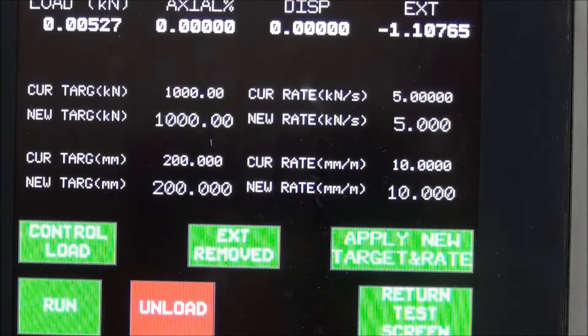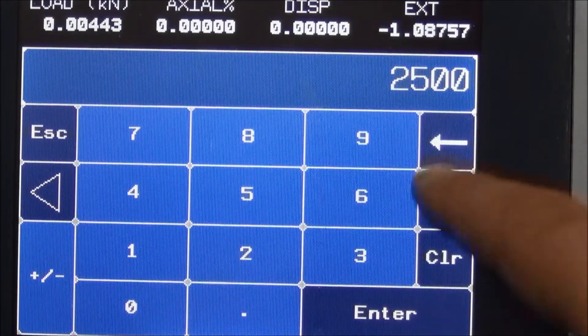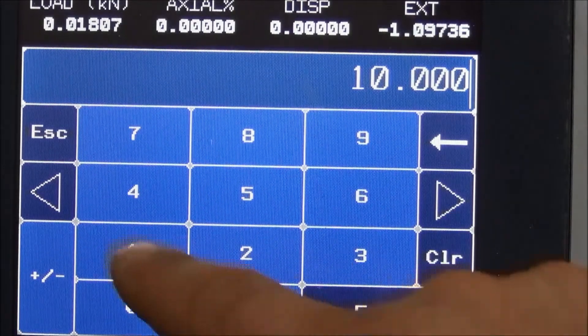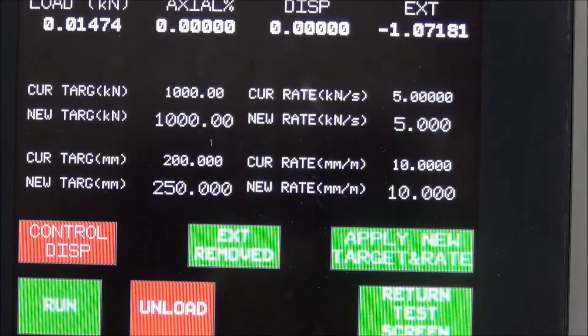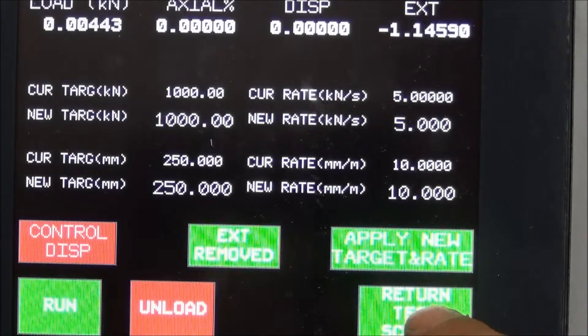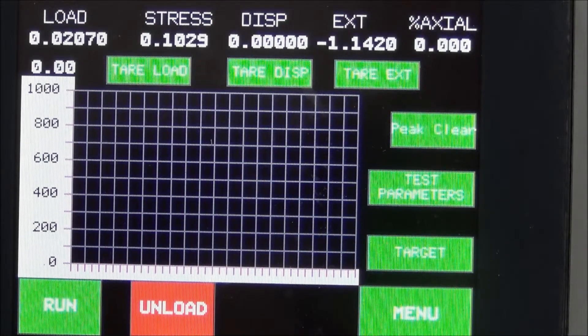If you want to perform the test in displacement control, press on the control box and change to red — displacement control mode. Change the displacement speed by touching on the displacement value. Touch the return test screen to start the test. Before starting the test, enter the rebar dimension and type.